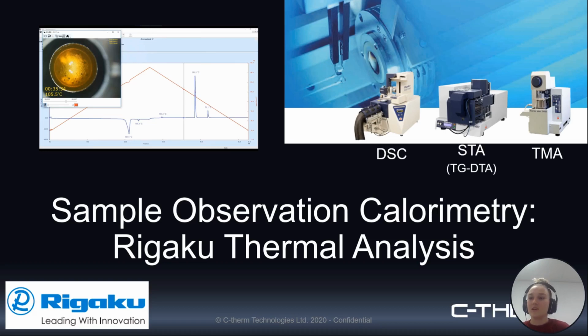As John mentioned, today we're going to be talking about sample observation calorimetry, and we are partners with Rigaku, a great group out of Japan. They're really top of their class in thermal analysis. As you can see on screen, we have 3 instruments in this thermal analysis line: the DSC, the STA, and the TMA. With today's topic on sample observation, I'm going to focus on the calorimetry instruments, so the DSC and the STA. The TMA is great also for measuring thermal expansion, but won't be the focus here today. So with that, let's jump into it.